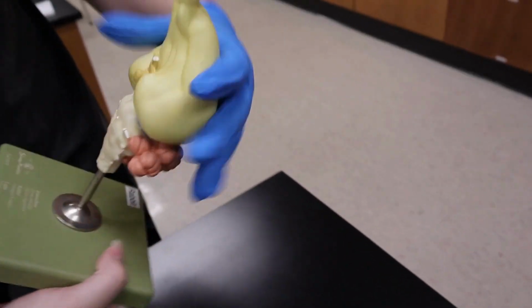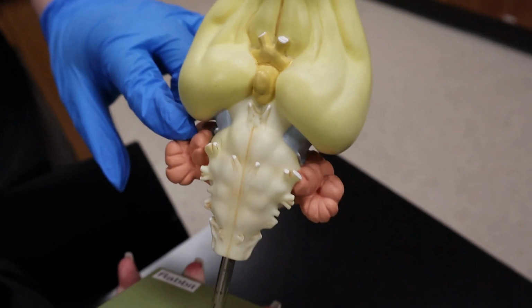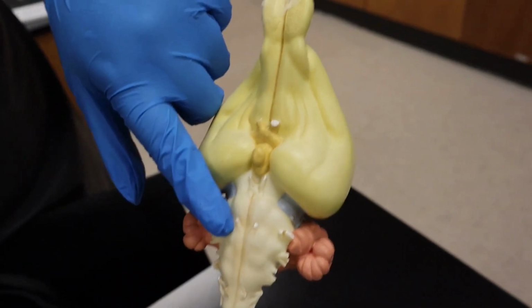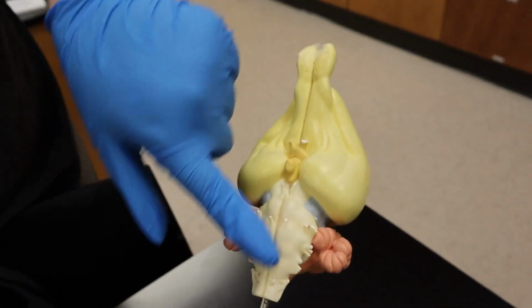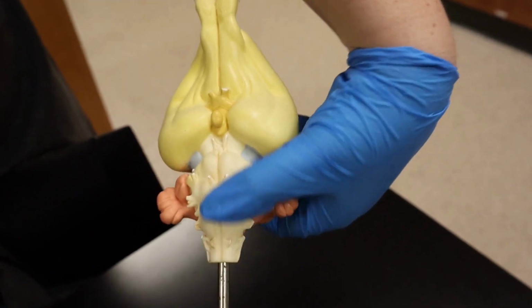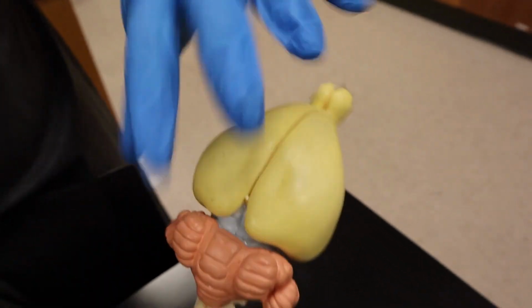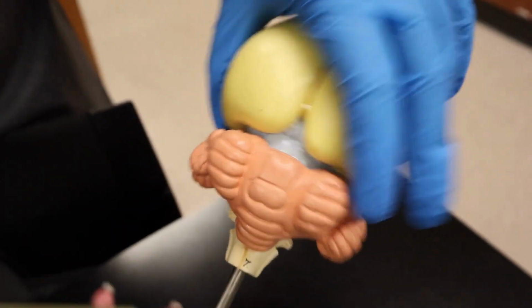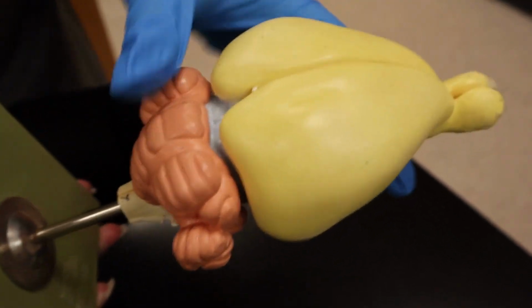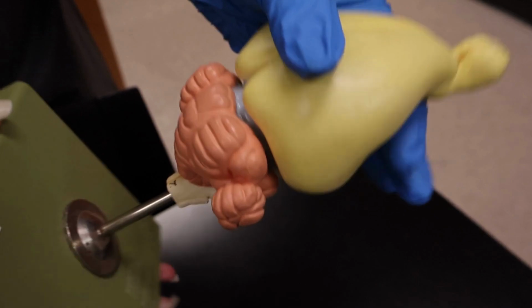Okay, so we have this cream color right here, which is going to be our medulla oblongata. It is part of the brainstem and has automatic functions like digestion, breathing, heart rate, as well as blood vessel activity. So that's what this part of the brain, the medulla oblongata, is going to be responsible for in the rabbit. Right, and so then we have our peach color right here. This is going to be the cerebellum. It's going to be for coordination, balance, as well as motor skills. These are very essential in avoiding predation in the rabbits and stuff like that.